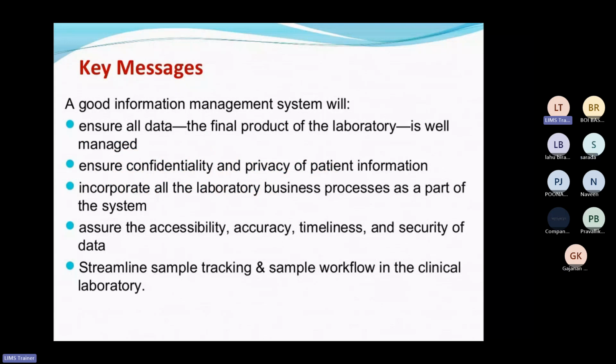So, information management will be good. When will it be good? If all the data generated in the laboratory is ensured, then it is good information management. It ensures the confidentiality and privacy of patient information. This is related to clinical trials. In clinical trial laboratories, the data is confidential, and there should be no leak of that particular patient information. This functionality is provided by the software.